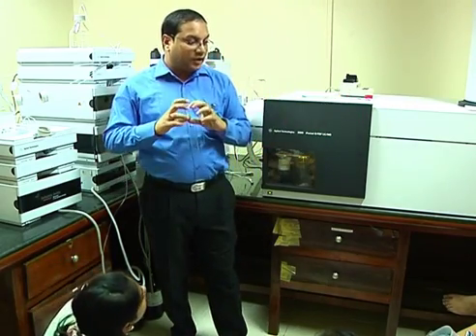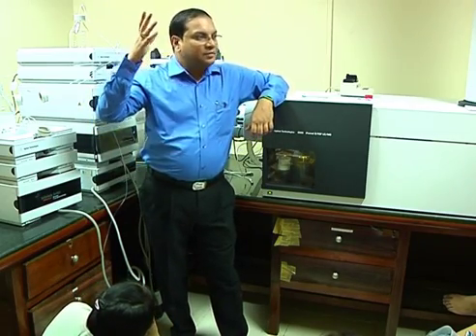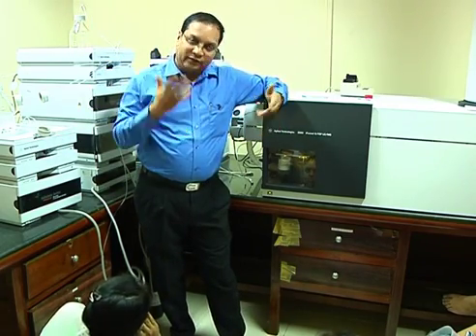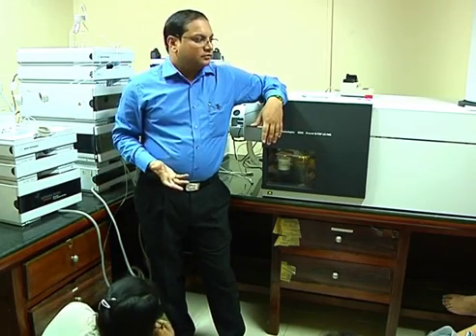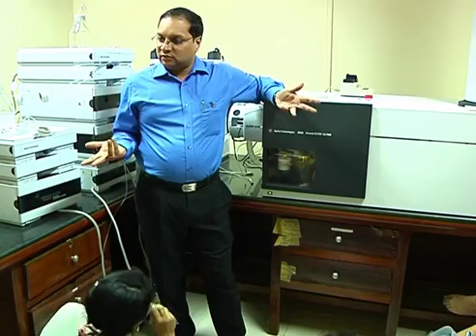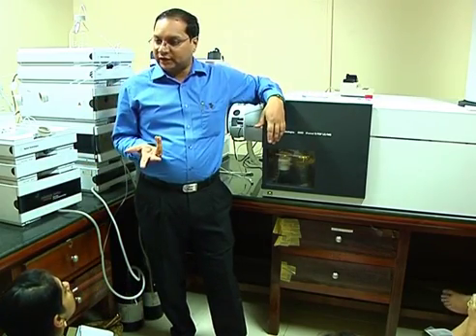So if I submit triple quad data to a database, there will be many peptides of the same mass but different sequence. It will pull out all the information because it doesn't have accuracy. It will see as 500 and 501 only, and you will get redundant information. For the same mass, you will get hundreds of peptides. You started with nowhere, you end up nowhere. So what to do next? I don't know which out of these 50 peptides is correct.